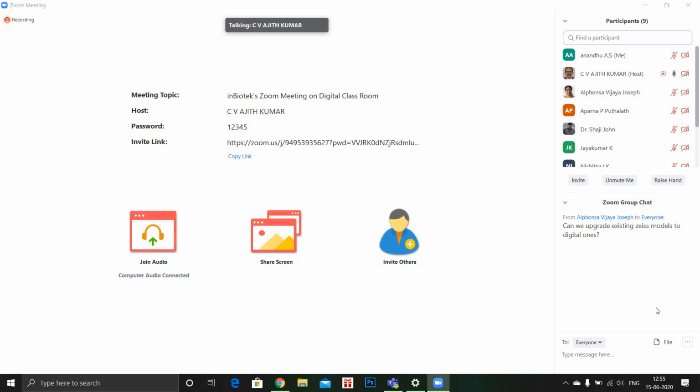One question I am seeing: can we upgrade existing models to digital ones? Surely we can. If there is a trinocular available, or if there is a binocular also, we can change it to trinocular and upgrade it for the digital classroom. Yes, madam.